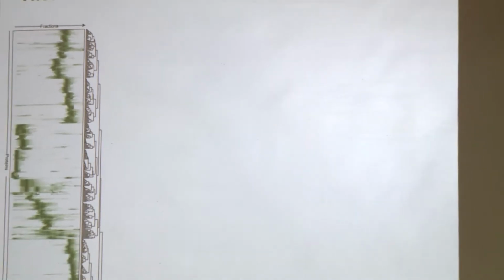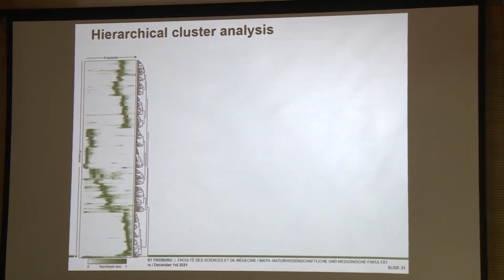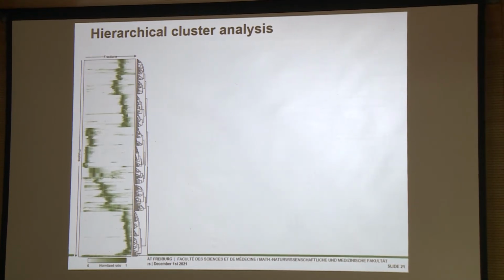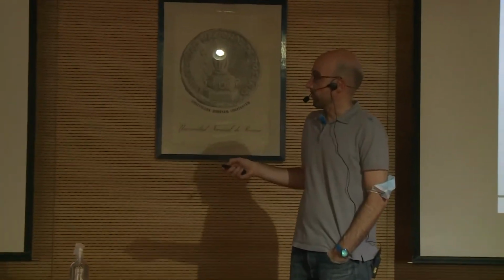But then you can do this now, because we did this on a proteome scale, right? You generate thousands of protein profiles, and then you can analyze these again by different clustering approaches in order to group all the profiles that have a similar pattern, right? And you can see here that we generated then many clusters. This would be a hierarchical clustering approach in this experiment.